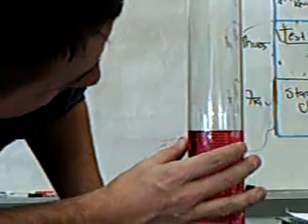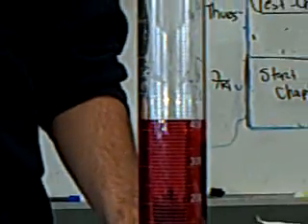Again, we read it to the bottom of the meniscus. We could get much more specific if we want to use pipettes and things, but for the sake of just mixing chemicals, this is a specific enough measurement.